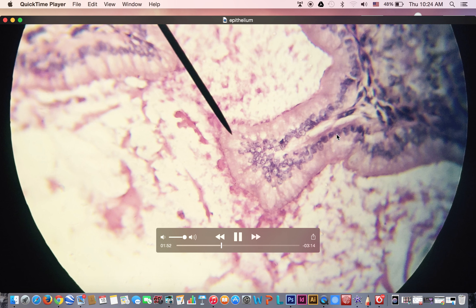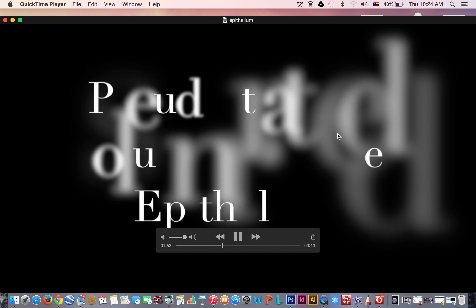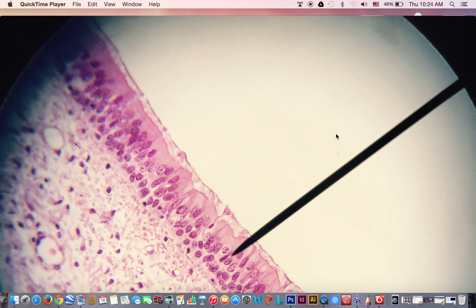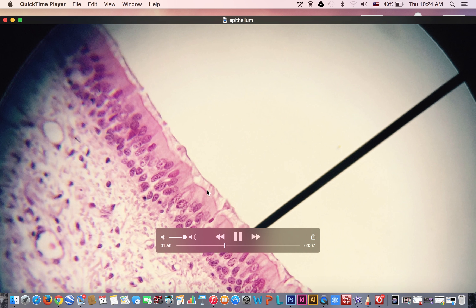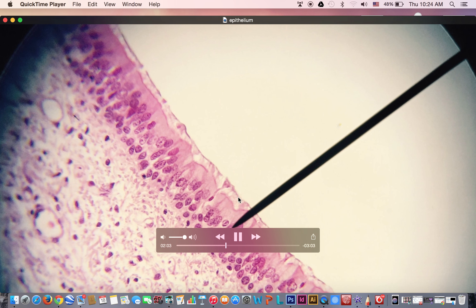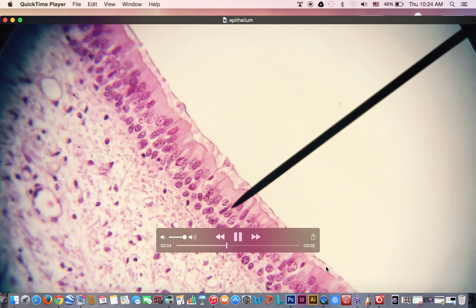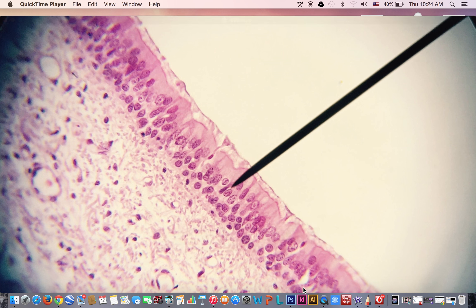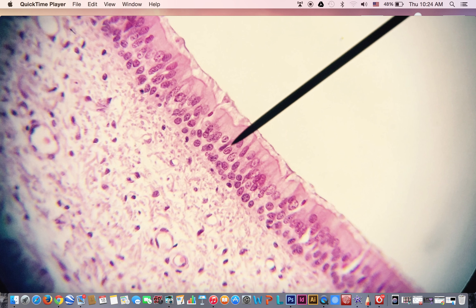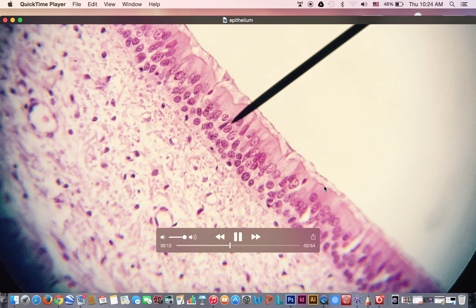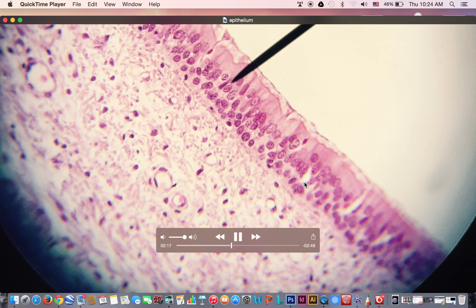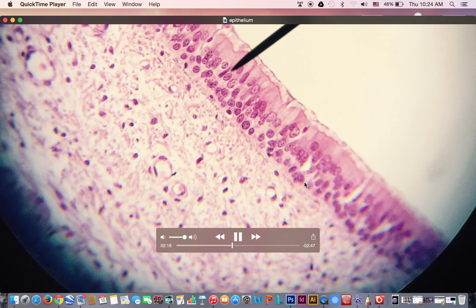The other type is the pseudostratified columnar ciliated epithelium with goblet cells. It shows different layers of nuclei, the presence of cilia, and empty spaces representing the goblet cells. This combination — different levels of nuclei, cilia, and goblet cells — is characteristic of the pseudostratified columnar ciliated epithelium.